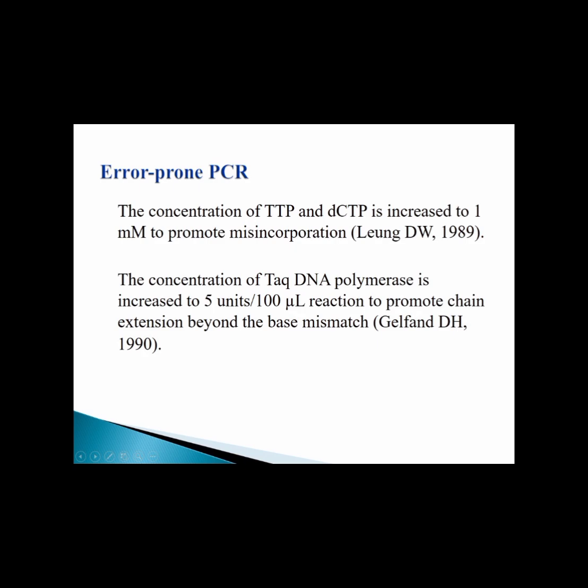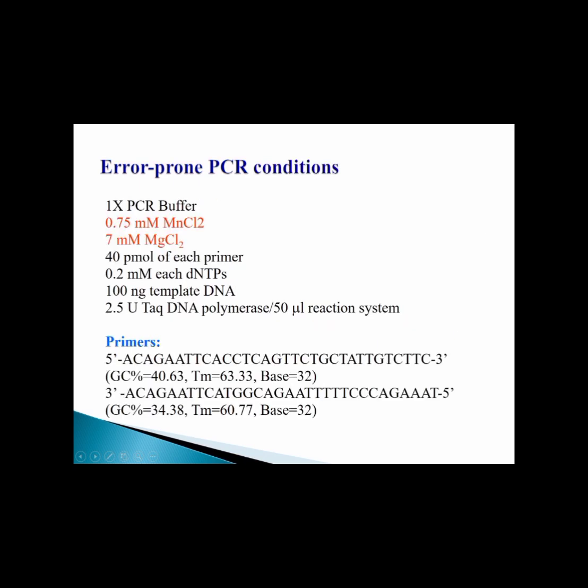And this technique is very important to create random mutations. It creates random mutations in the DNA sequences, so we can screen the function of mutations, or we can combine them by DNA shuffling.